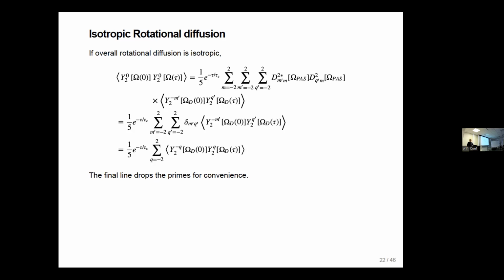It's approximately true if the local motions are limited. So motions are limited in a protein until they're not limited. And the not limited parts tend to be where you're most interested. So it's really still kind of the case that for a realistically anisotropic protein, where you have, say, loops with extensive motions that you're interested in because of binding processes, etc., all of these approximations start to break down in ways that we don't really know without doing simulations.